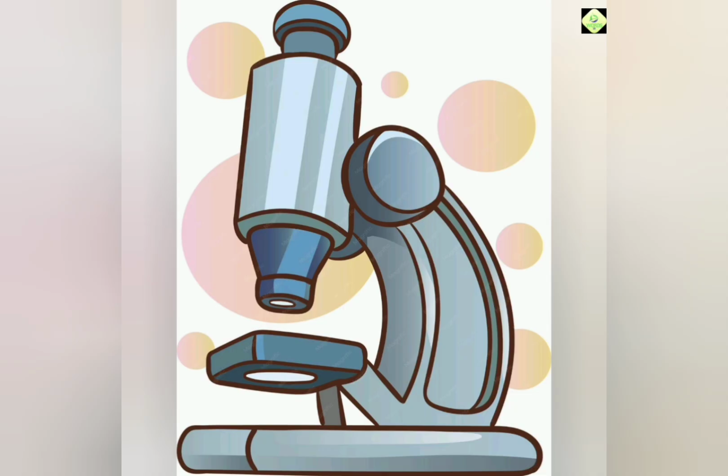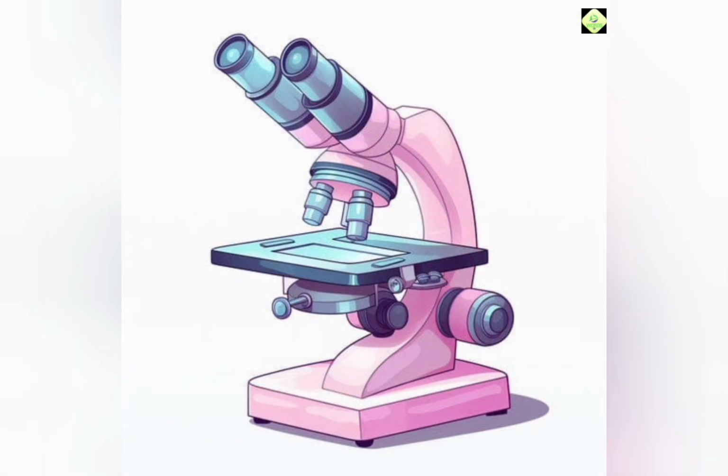The best image is obtained by opening the iris two-thirds and adjusting the lamp brightness to give illumination with the minimum glare. Today's question: what is a microscope?